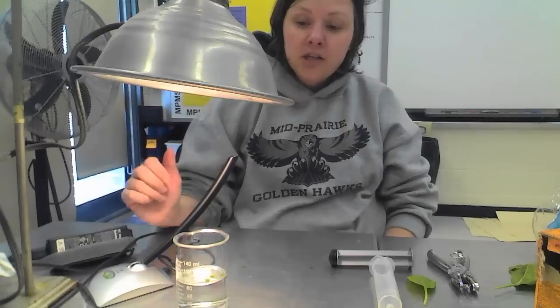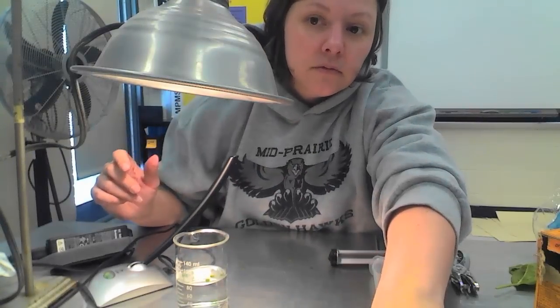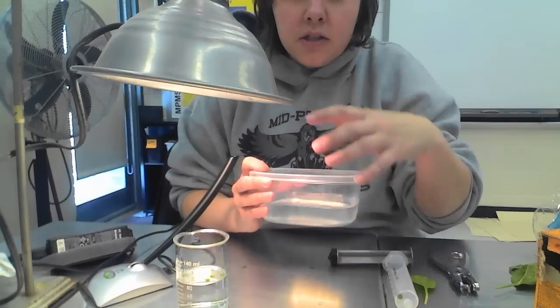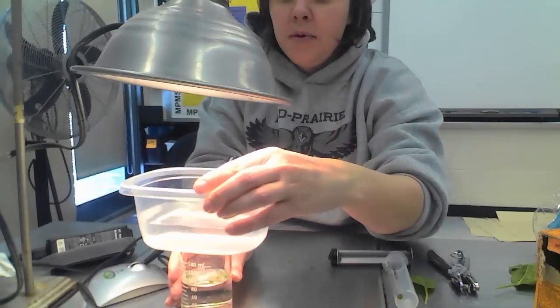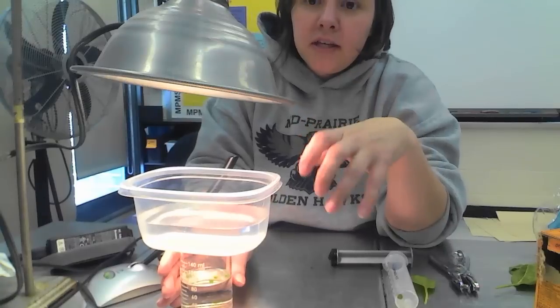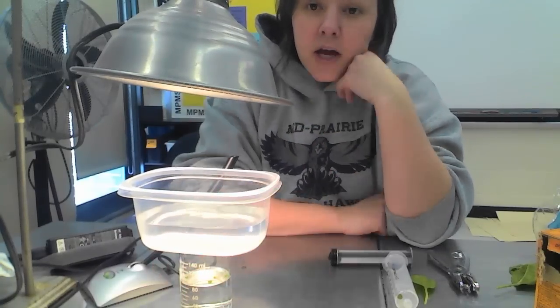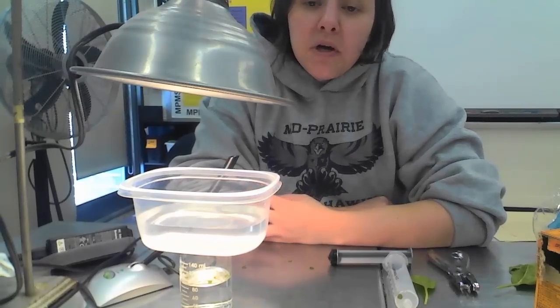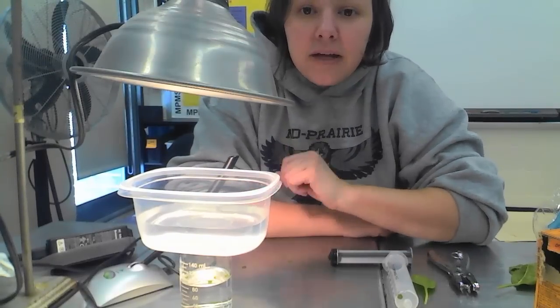So you may need to put a container of water over it. If you notice, I have a container of water that I'm going to sit right on top, which is going to absorb all the heat but allow the light to pass through. That way it can protect the leaf. What we're going to do is fast forward it so you can see what actually happens.